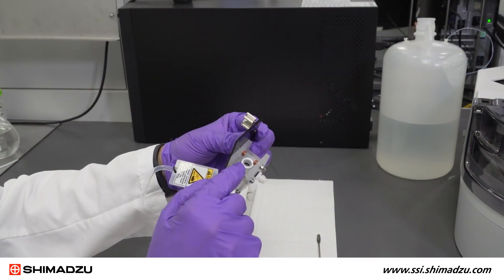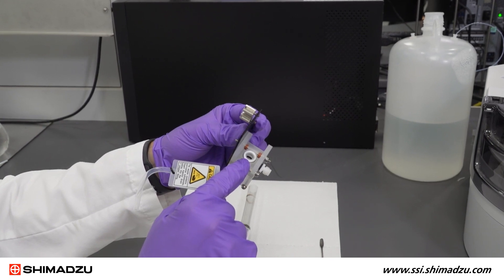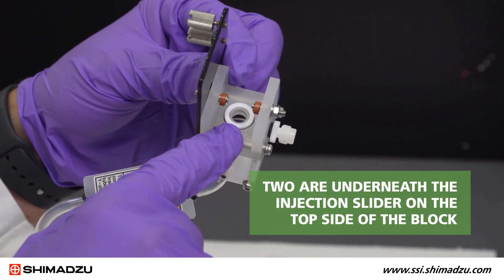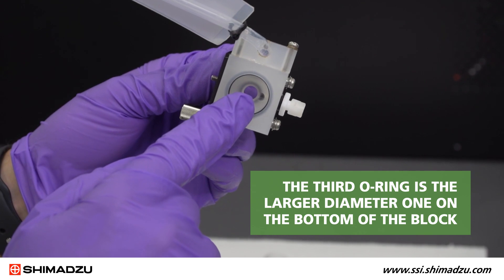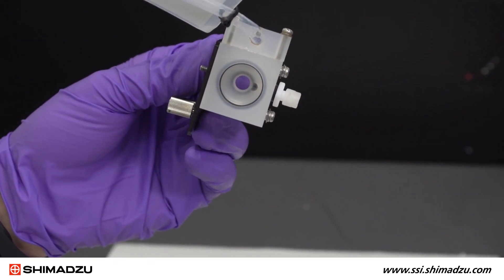There are three O-rings on the injection block that also need to be replaced on an annual basis. Two are underneath the injection slider on the top side of the block: a white Teflon O-ring on top and a black Viton one below it. The third O-ring is the larger diameter one on the bottom of the block that seals around the top of the combustion tube.